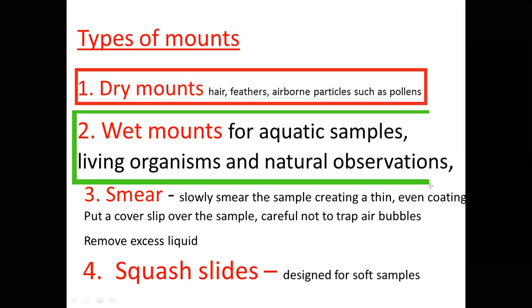So you are supposed to observe with the shortest time possible. Like now, in 2014, most of the cells, after some time, were being immobilized, they were dying. The yeast cells were dying after being exposed to the atmosphere. So most students got frustrated.